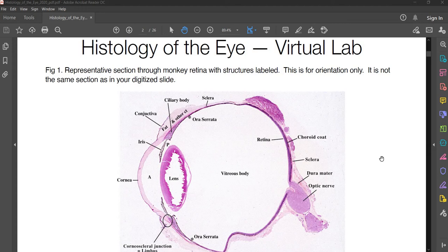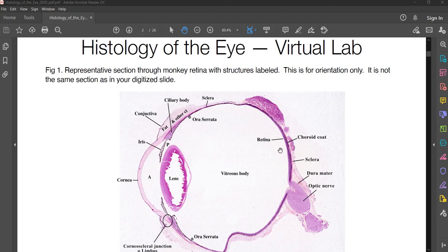Before we get into it, I just want to make a note about orientation. A lot of the structures use terms like inner and outer, and just remember that the reference point is actually the center of the globe of the eyeball. That's why the sclera is considered part of the outer shell, whereas the retina is part of the inner layer, even though in this particular image the left side of the screen is the outside world and the right side goes more towards the body.